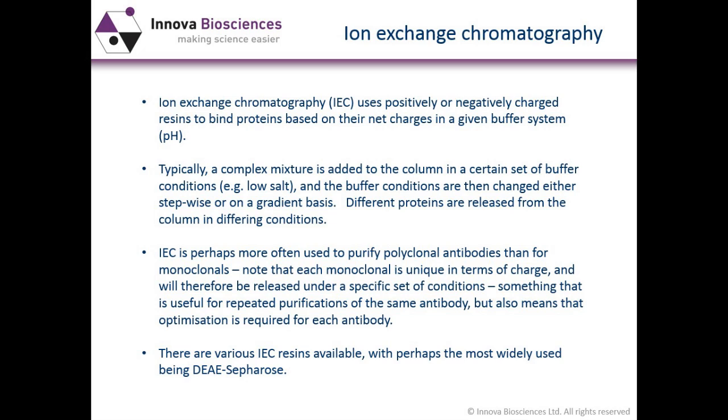Ion exchange chromatography is probably more often used to purify polyclonal antibodies rather than monoclonal antibodies, which tend to be purified more by protein A and G, as we'll discover later.